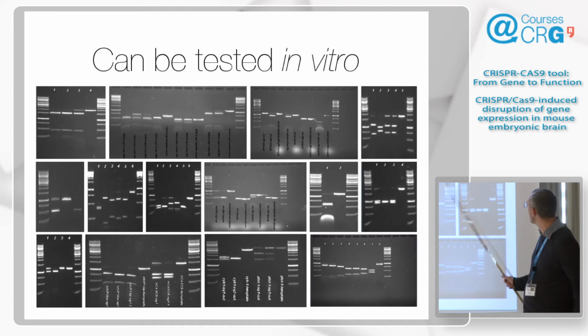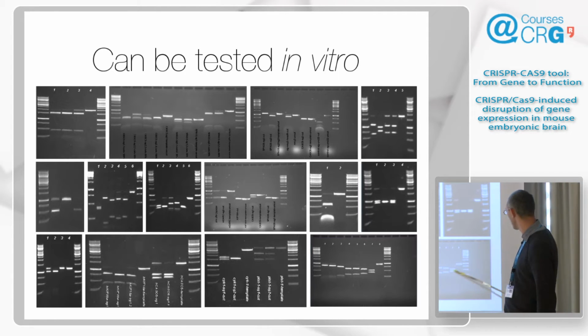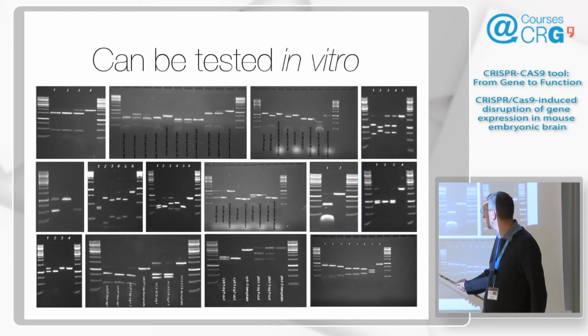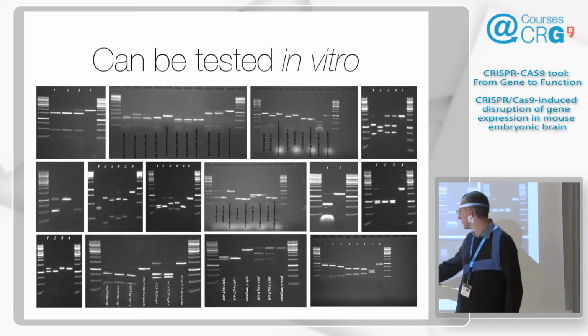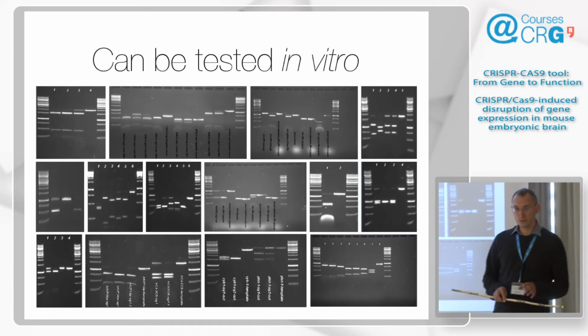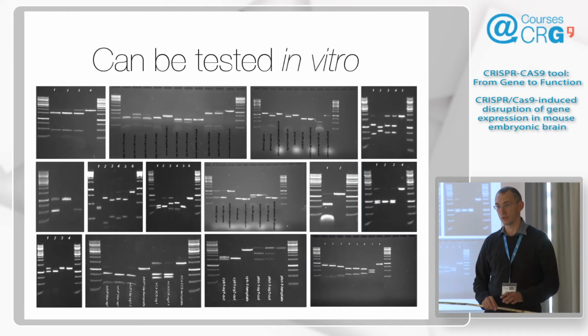And you will see that often everything works, but there are cases, and in this example, everything works, but there are problematic ones. So this is like 50%, and there's some that are even worse. Often you don't have a choice, so you get a bad one like this. If it cuts even a little bit, I will use it, because in vivo this is usually enough to give us an edit. But we have seen some that totally don't cut in vitro, and of course they also don't work in vivo.